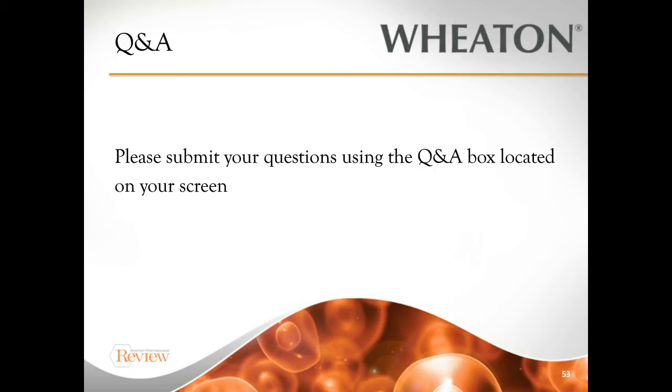Now, we've done a little bit of an experiment on hitting it with a kilogray. I believe it was anywhere from 25 to 35, and we were able to change the color to yellow, but the color actually turned back to its transparent self within 7 days. So hopefully that answers your question. It's not as straightforward, but yes, gamma irradiation will change the color of COC. It is associated with the resin as well, though, and most of the time it will turn back to its original color over time, whereas glass will not.